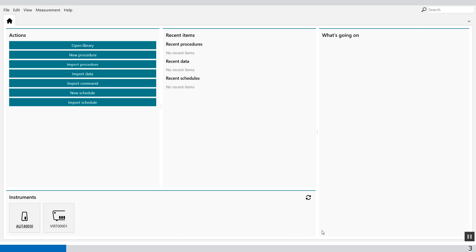This procedure described in this video is a simulation of an experiment which can be used on the dummy cell A. A constant potential method is used. The procedure and data analysis tools can be easily adjusted for a constant current method. The experiment uses a repeat loop to apply a sequence of overpotentials relative to the open-circuit potential on a fuel cell and measures the discharge current and cell potential for each overpotential. Each measurement takes approximately 5 seconds with an interval time of 0.1 second. At the end, the average value of the current and potential are calculated using the last 10 data points of each step, and the average potential and average power values are plotted versus the average current values.